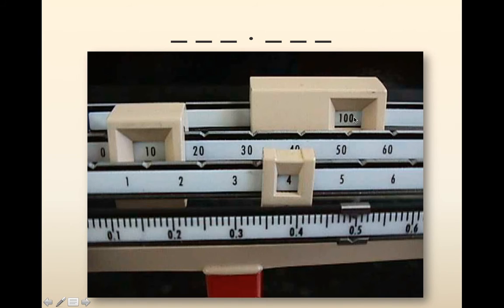If we look at this, so we know it's 100 plus 10 is 110, plus 4 is 114, so that's certain. Then we see it's 114.4. And then we see it's between 0.09 and then, so it's somewhere in there. So our certain digits are going to be 114.49 something. So let's see what we get.